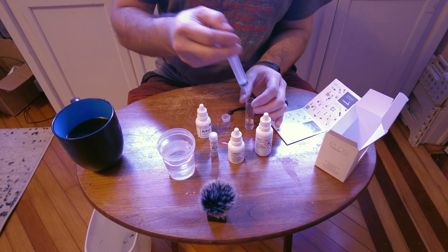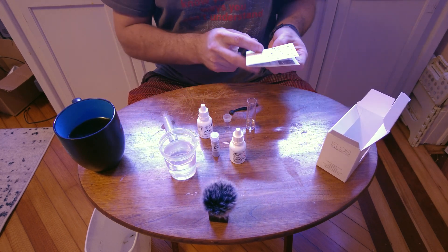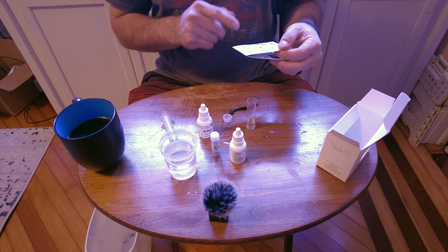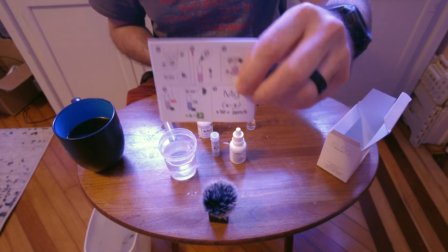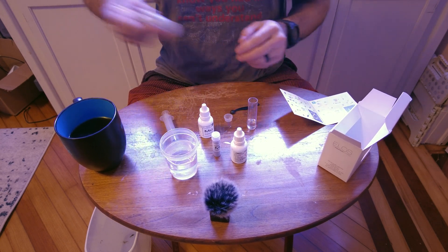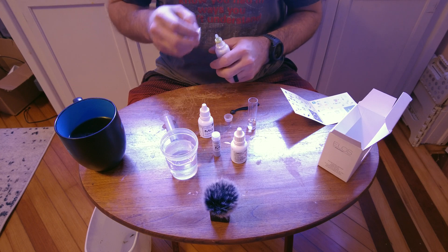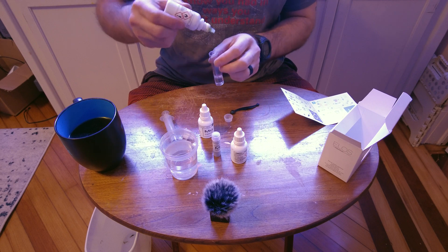This first step is to figure out our first number. The ELOS kit uses a calculation to determine your result: your first test result number of drops, minus your second test number of drops, times 50. Shake Reagent A for 15 seconds. Based on previous reviews, this should take almost 30 drops, so I might fast-forward through part of this.